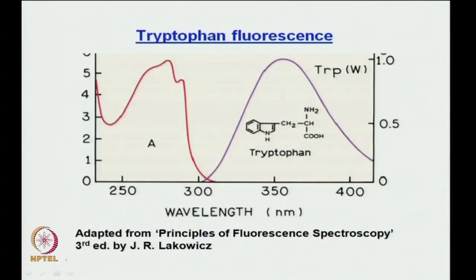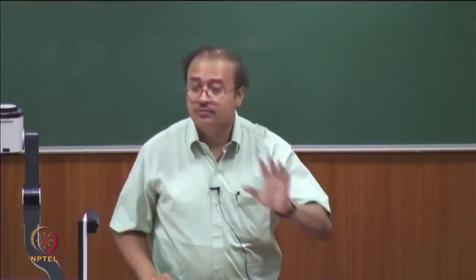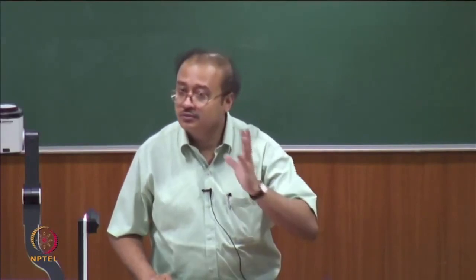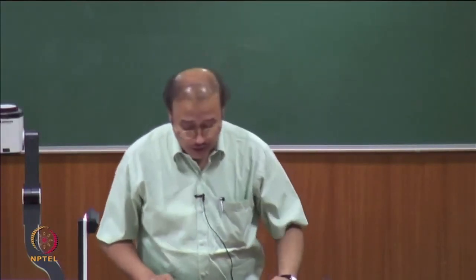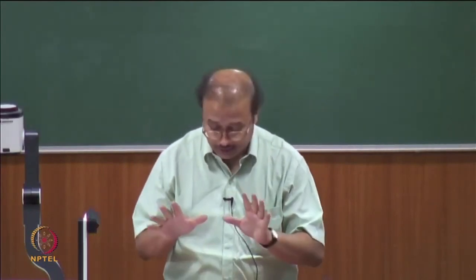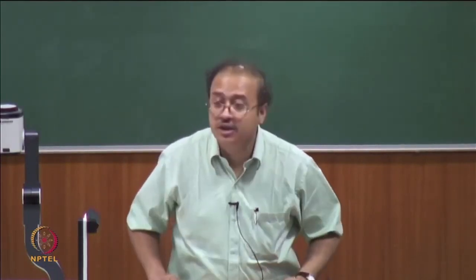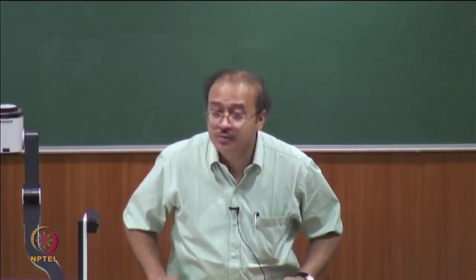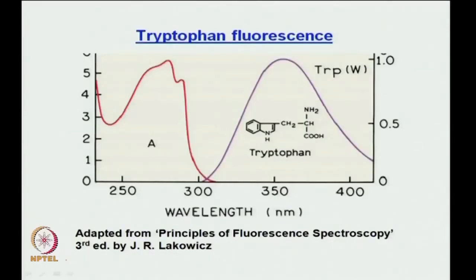Now let's end the class by looking at some of your protein fluorescence, so that you can have some feel about how people use these things in their biophysical studies. I've taken these figures from this book on fluorescence spectroscopy by Lakowicz. This is a really good book. If you are interested in fluorescence, you should definitely have a copy of that and look that up.